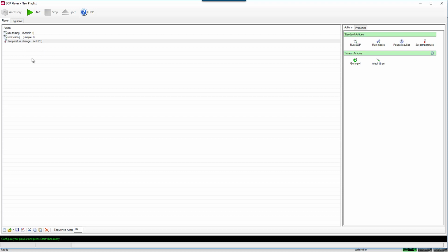So all the zeta potential cells, the disposable folded capillary cell, you cannot use them over 70°. So anything below that is okay. If you're using a sizing cuvette and it's a polystyrene cuvette, just make sure that you don't go too high in temperature, obviously, because you wouldn't want to melt the cuvette. So you have to be a little bit careful with designing those types of experiments here.